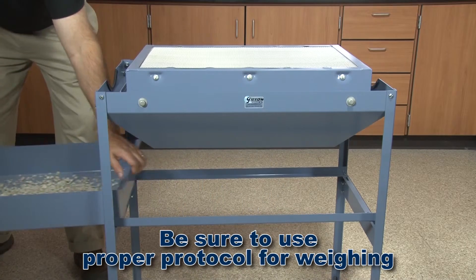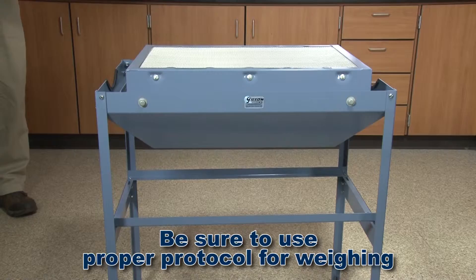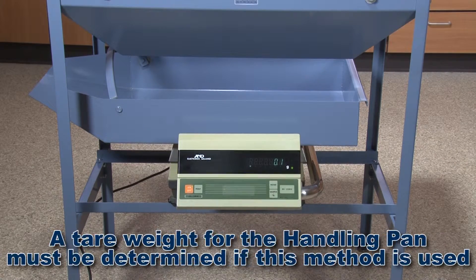Content in the handling pan can now be carefully dispensed for weighing. The TSA 167 Clean & Weigh accessory can also accommodate a high-capacity electronic balance, and this operation will significantly speed up weighing of sample fractions.